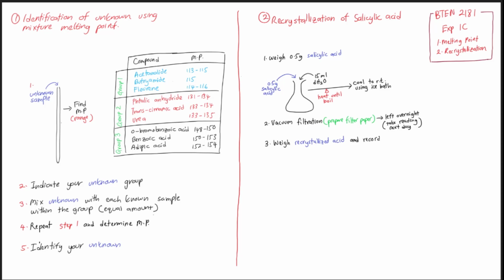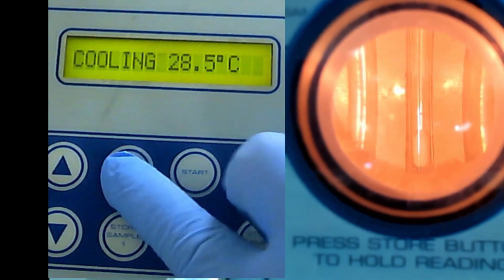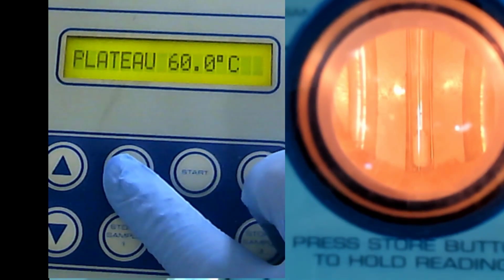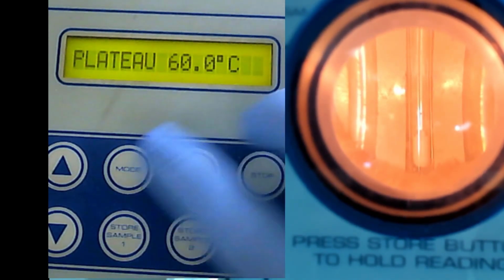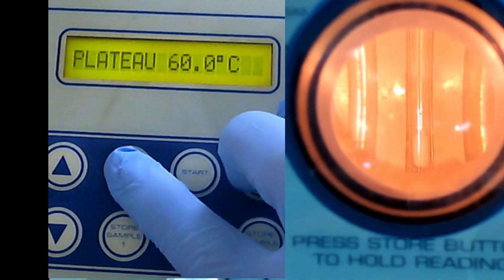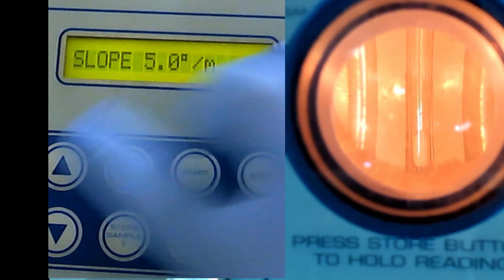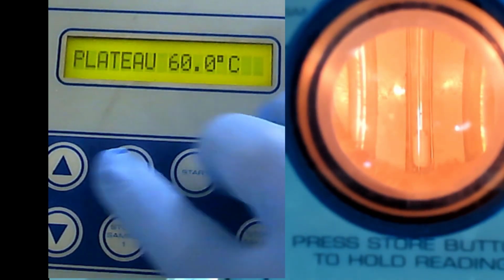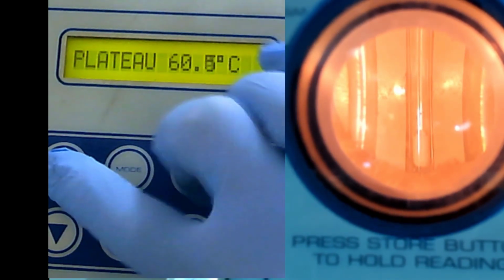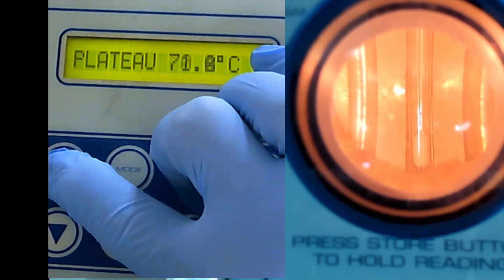Wait, where is my mouse? Okay, that's why we want to change our plateau here. Instead of going to 60, we want our plateau around 90, like that. Okay, so how to change it? We just press it for a while. I don't remember this, but I think you just press it. So we will go for like 90, because that is nearer, so you don't need to wait.